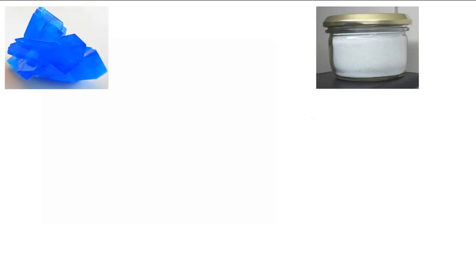Before I draw that up, this here is a powdered form of copper sulfate, CuSO4, and this is also copper sulfate, CuSO4.